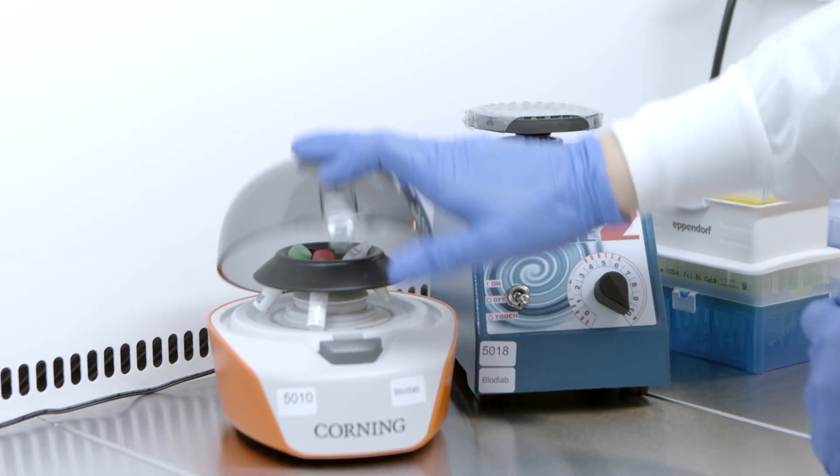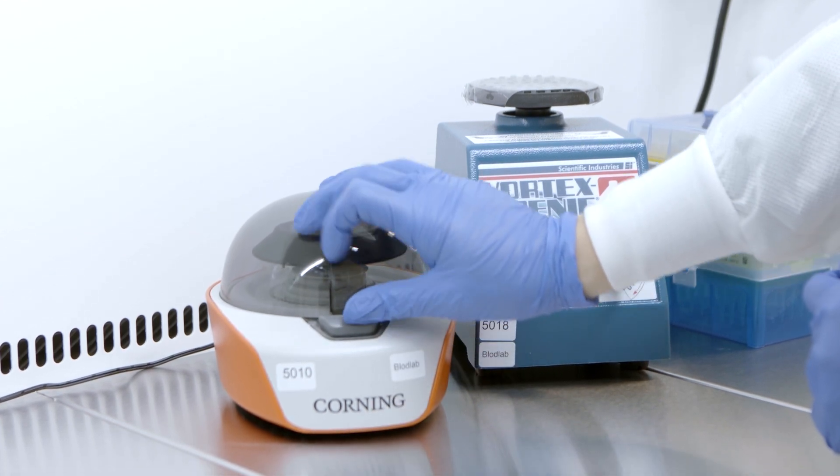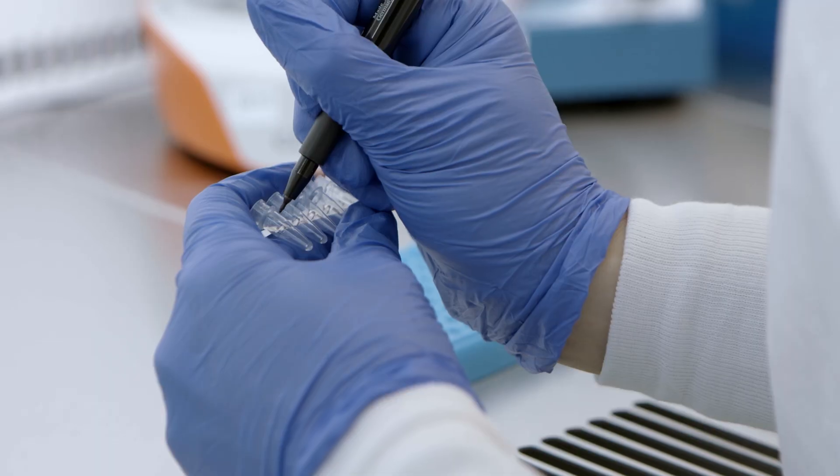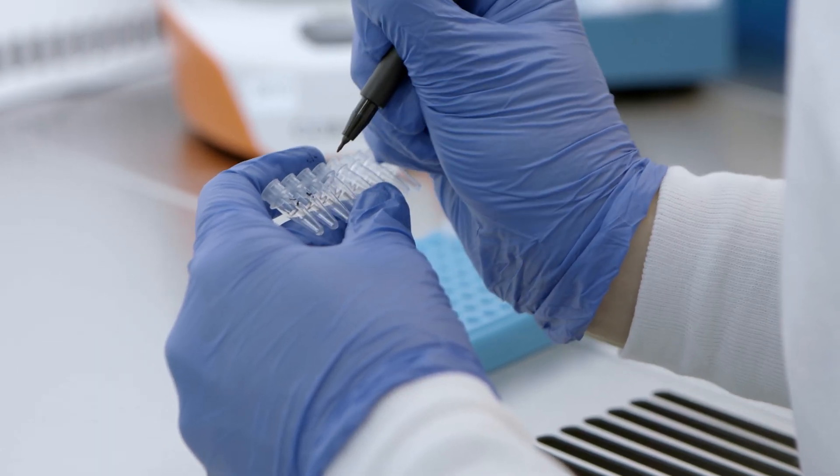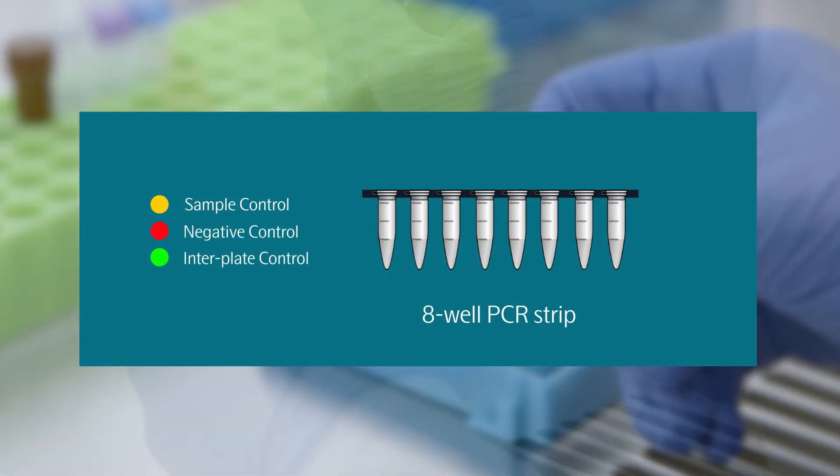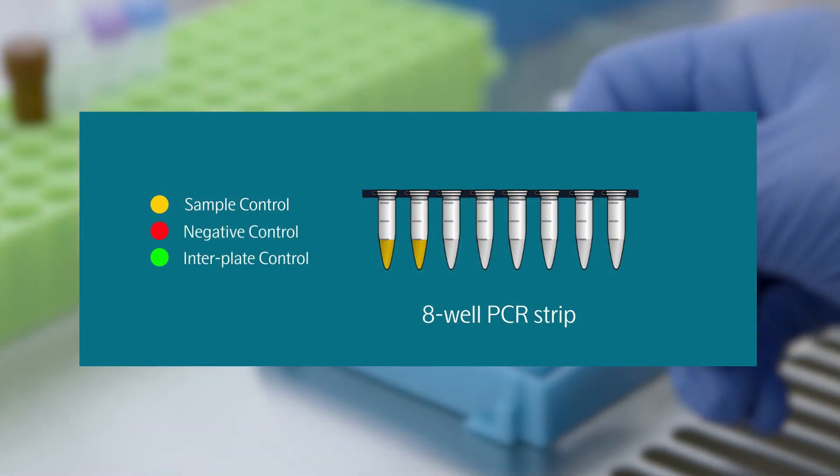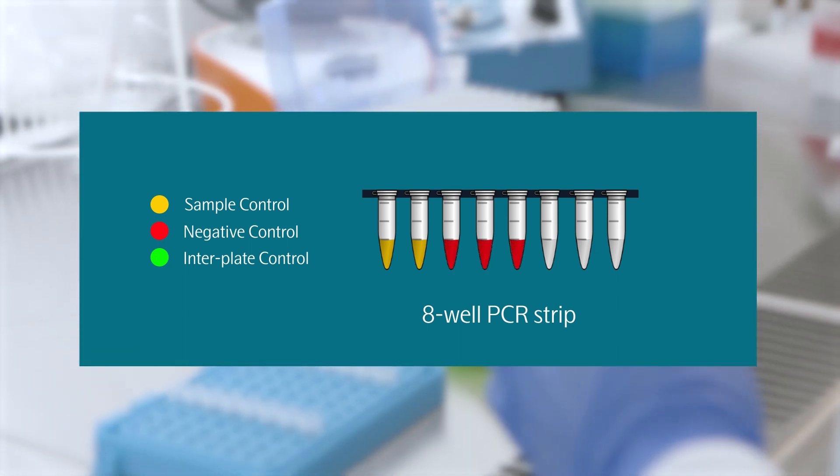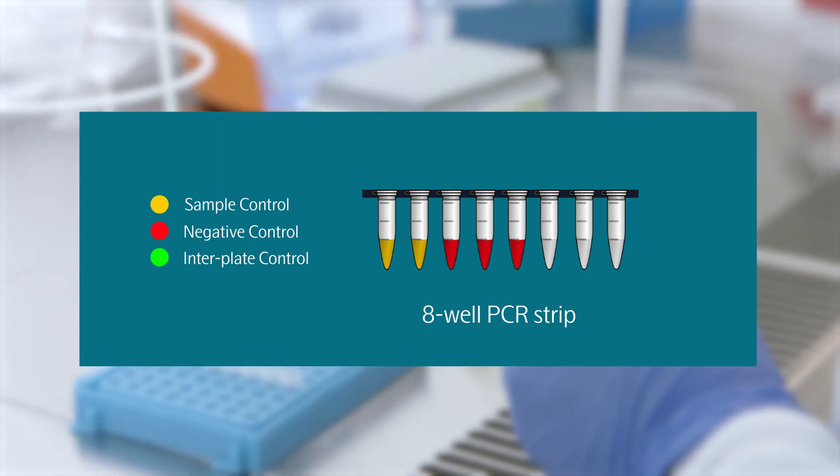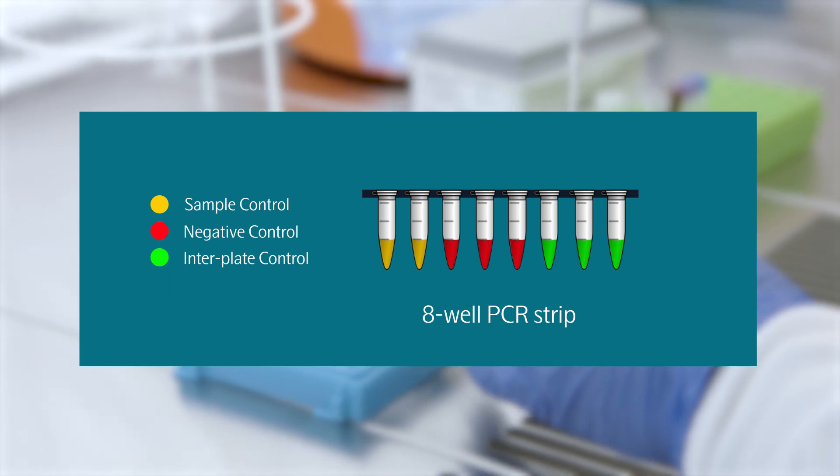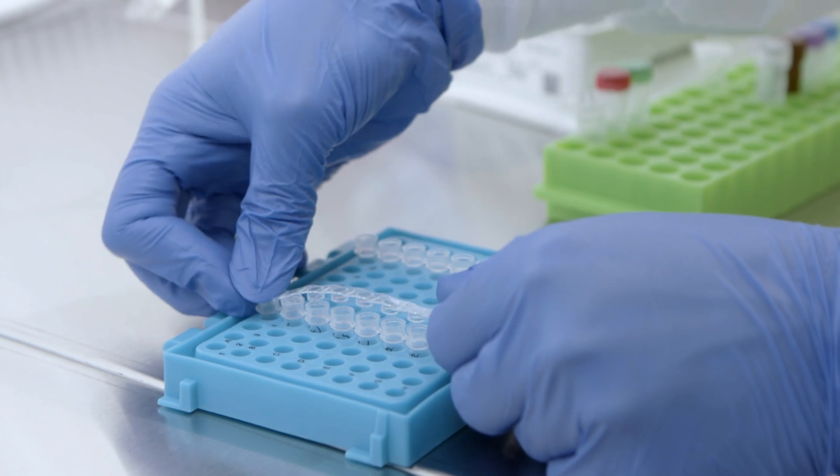Vortex the negative control, interplate control, and sample control, and spin them down briefly. Label an 8-well PCR strip with these controls according to the following order. Pipet 5 microliters of the sample controls into the first two wells, 5 microliters of the negative control into each of the next three wells, and 5 microliters of the interplate control into the final three wells of the PCR strip. Cover the strip tubes and set those aside.